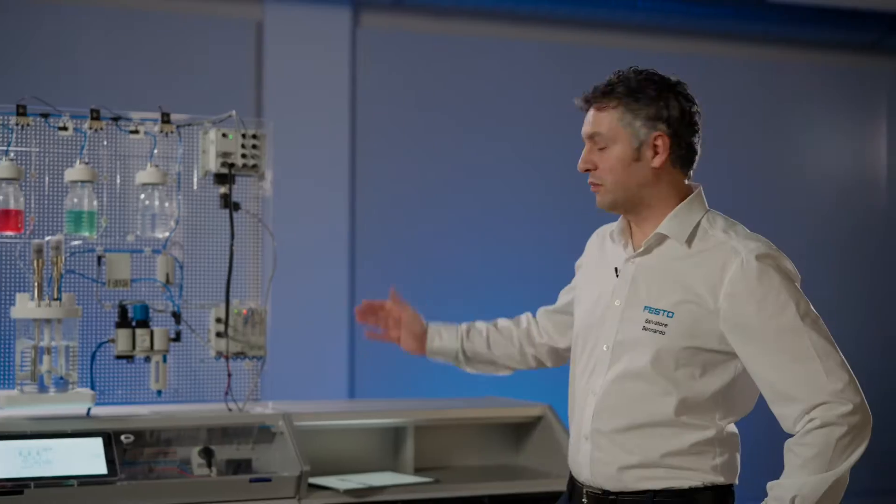My name is Salvatore Bernardo. I work at Festo Didactic and I helped to create this bioreactor on the subject of biomechatronics.